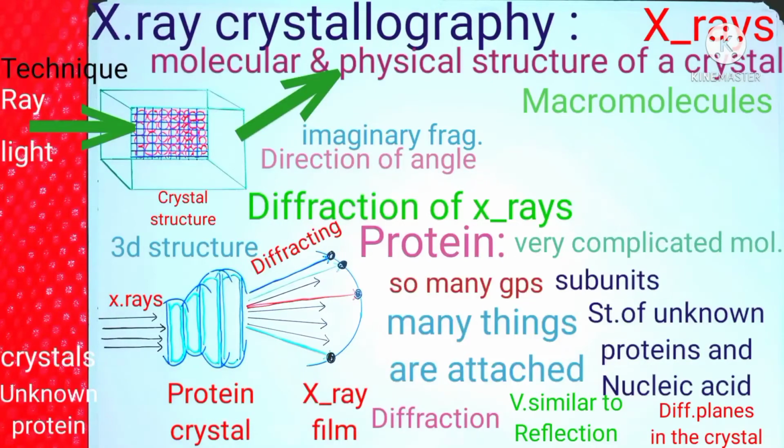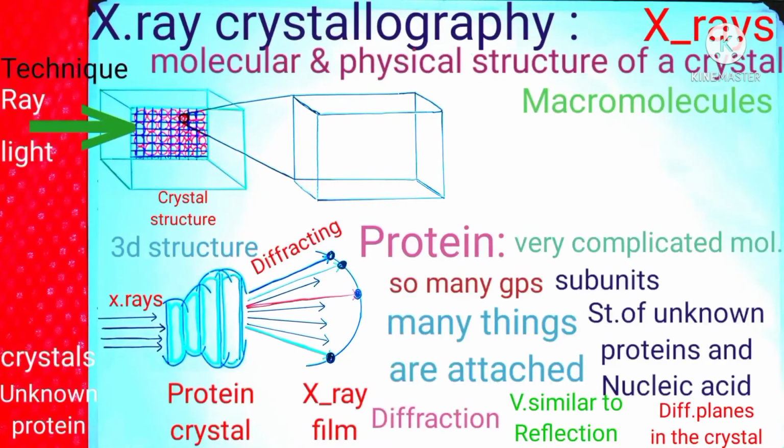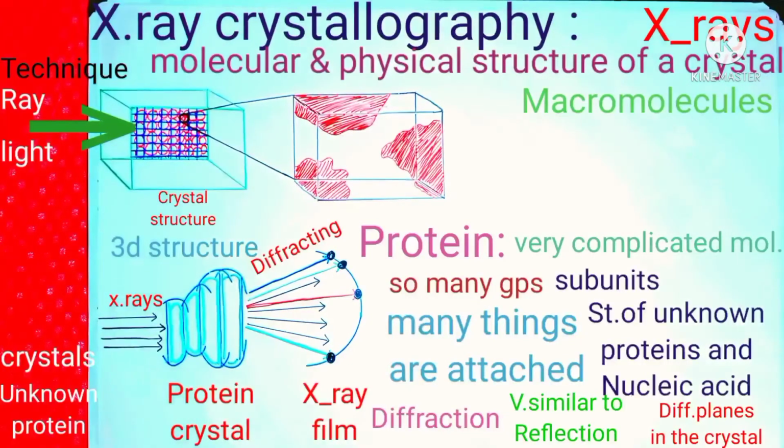Now we take each of those imaginary units of the crystal. Now we will not take the whole crystal, but only a smaller part, a smaller fragment. And if we zoom in here, one of such smaller fragments gives us a structure like this. This is a zoomed in portion of a smaller unit fragment, and this unit fragment has some portions of proteins. So these three red colored regions are the portions of proteins, fractions of proteins present in this small zoomed fragment, right?